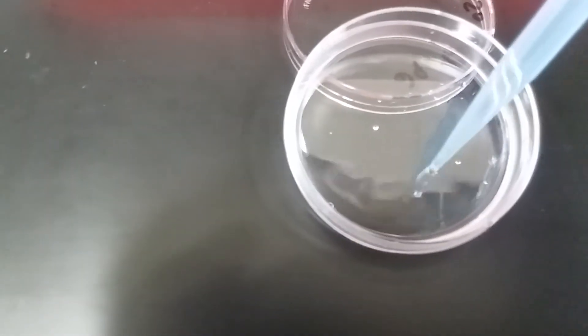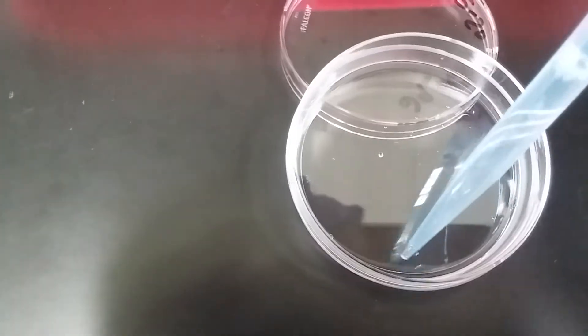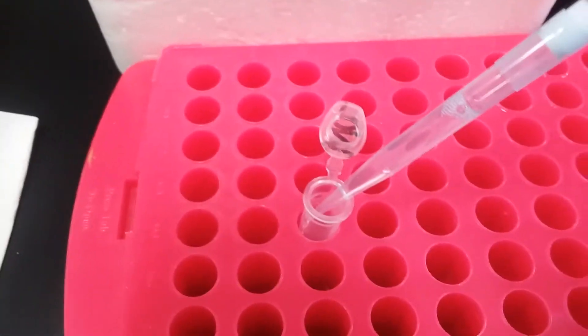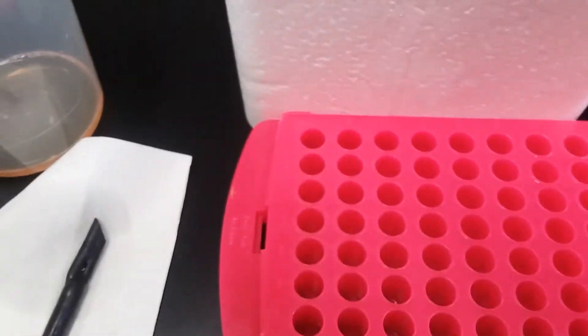Sometimes it's super gummy, and this helps break up that gumminess, and I will deposit that whole cell lysate into my tube, close it up, and put it on ice. Very important to put it on ice.